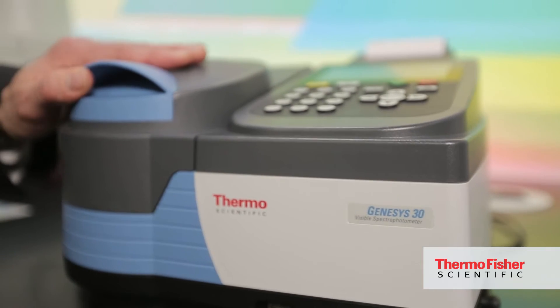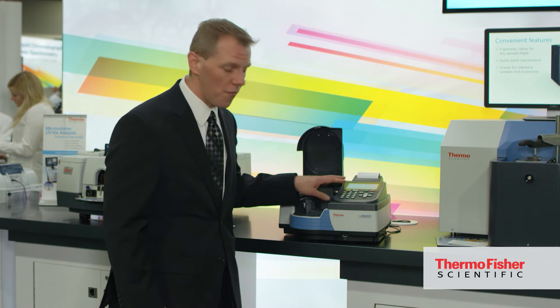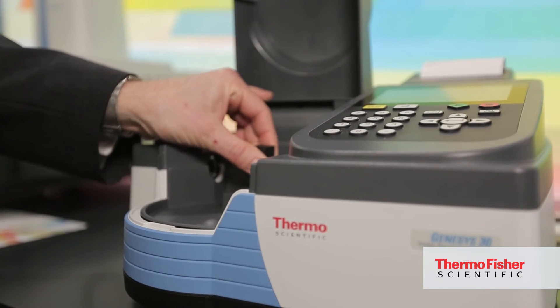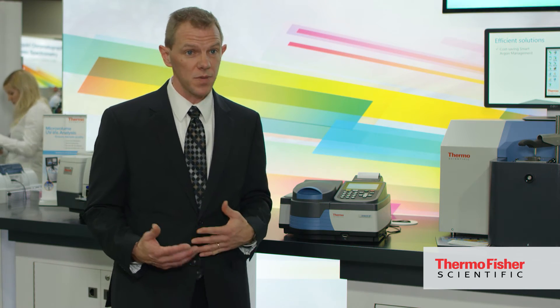It's really thoughtfully designed — whether you're looking at how easy it is to access the sample compartment, the rubberized keypad, the intuitive software, or the removable sample compartment so you can wash out any spills you might have. It's really designed for the user and to make sure it's going to stand up to years of use.